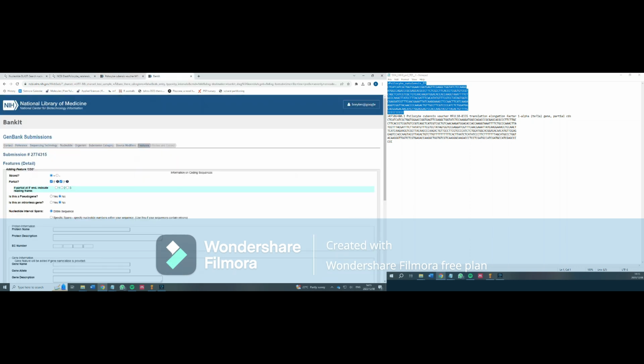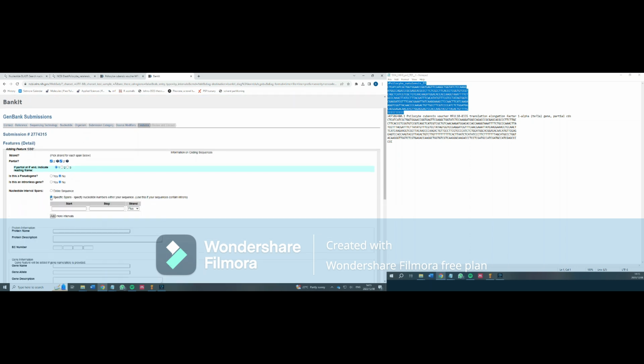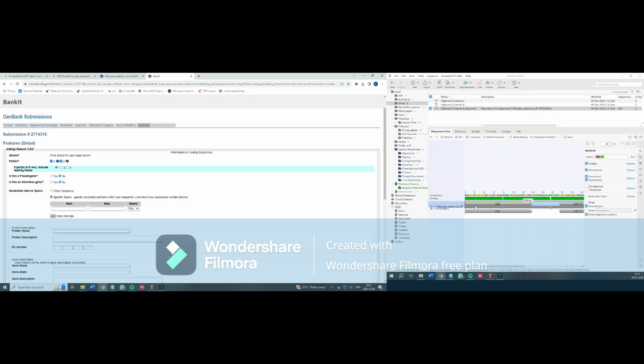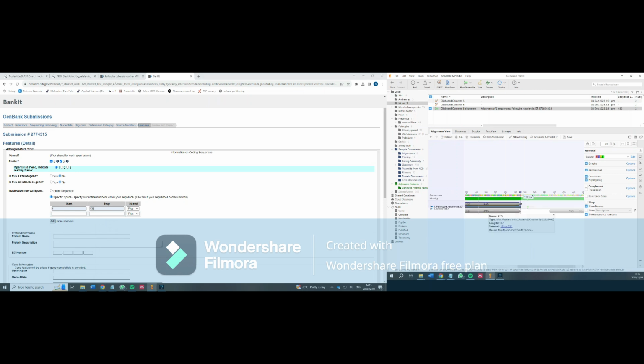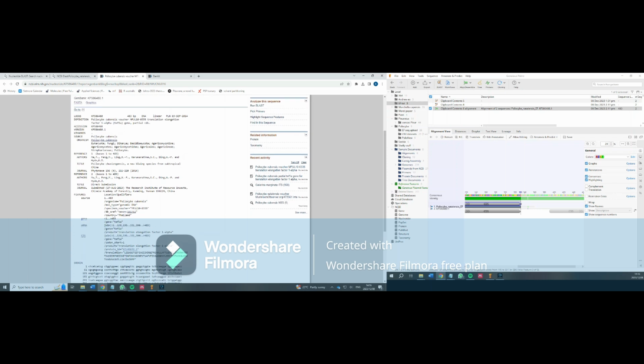And then this is where you include the annotated regions. So you can see, if you go back to Geneious Prime, we annotated 2 regions. You just add them here. The first one is 1 to 138. And the second one, just hang on, it's 195 to 331. And then that's it. You go to the protein name. Protein name is also something you can look back to the reference strain for the description of all these things. It should all be there.